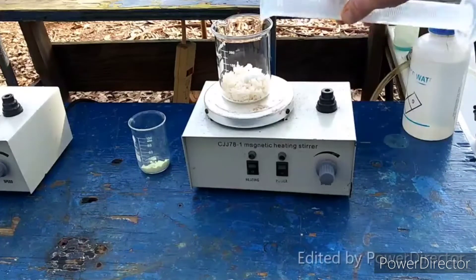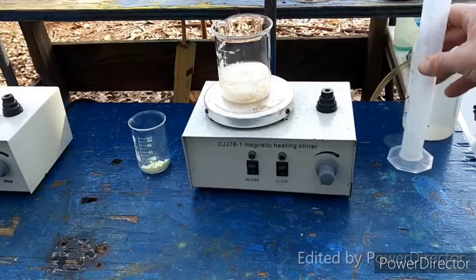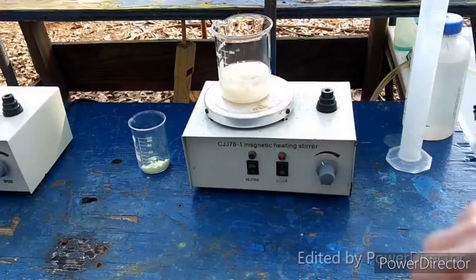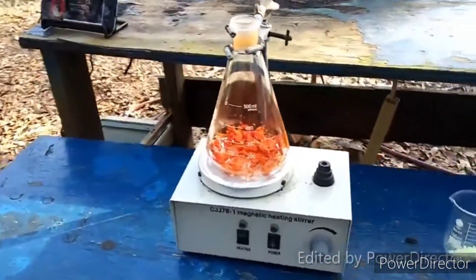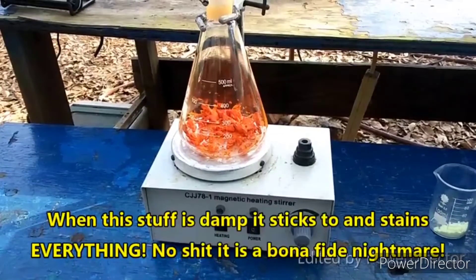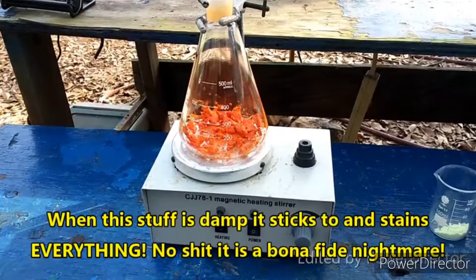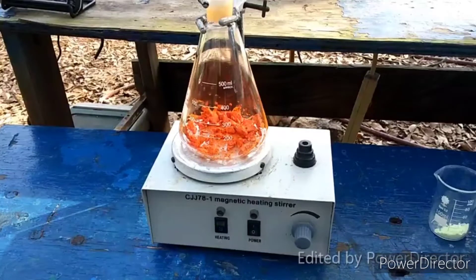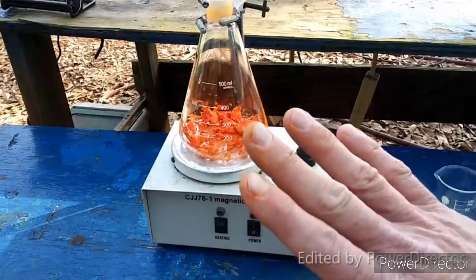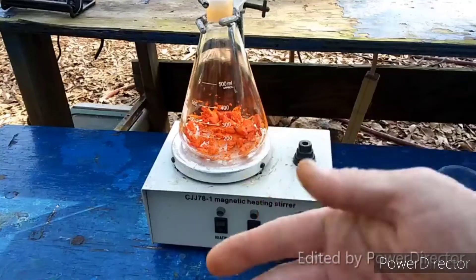We are then going to take this solution and use it to dissolve 17 grams of our antimony trisulfide, which I have over here. And as you can tell, it is only partially dried. This stuff probably makes an amazing pigment, because it sticks to fucking everything. It sticks to my hands — I have washed my hands like five different times today and they're still stained orange from this crap.